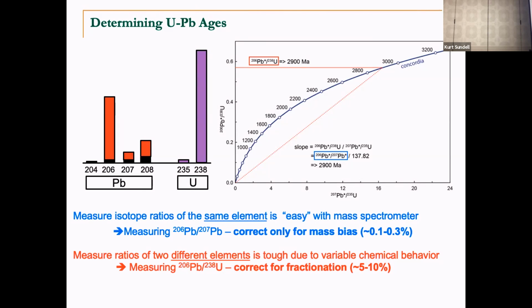That's really different from isotopes of two different elements, which is what we want to measure when we're measuring, say, uranium-238 to lead-206. Here, these things don't behave anything alike. From drilling the pit at the beginning, it turns out uranium-238 is much heavier, it gets stuck in the hole, and it doesn't come out as easily as lead-206 does. So we have this huge fractionation across these two analytes as they're measured. We have to correct for that, otherwise our ages are just completely off.